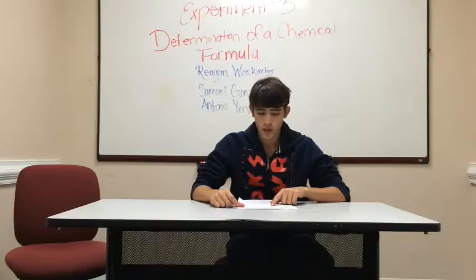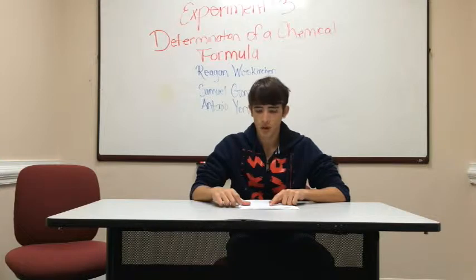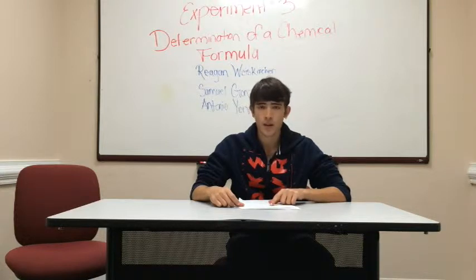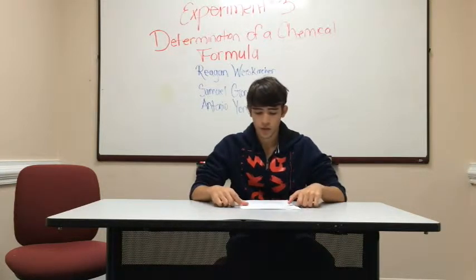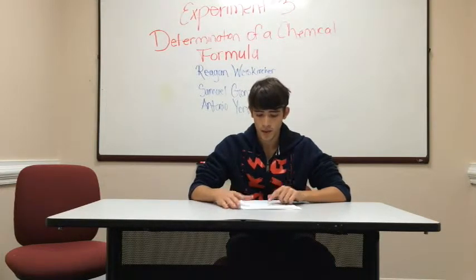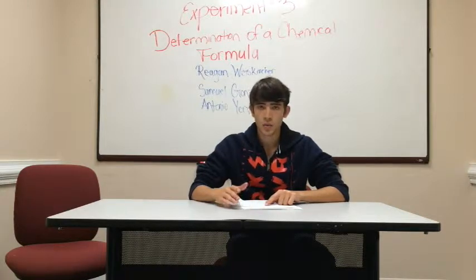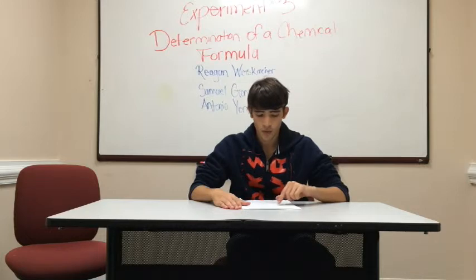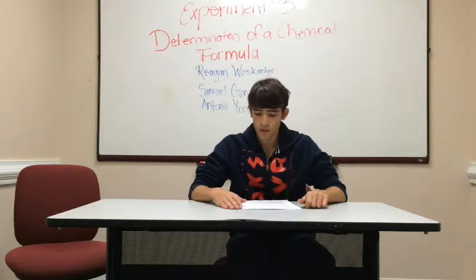In this experiment, we use the law of definite proportions to define the chemical formula for a hydrated compound containing copper, chloride, and water molecules locked in the crystal structure of the solid compound. The general formula for the compound is Cu(x)Cl(y)·z H2O, where Cu means copper, Cl means chloride, and H2O means water. Its name is copper chloride hydrate. The letters x, y, and z represent integers that will establish the proper chemical formula for this substance.